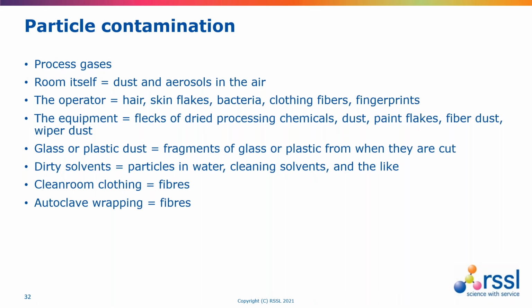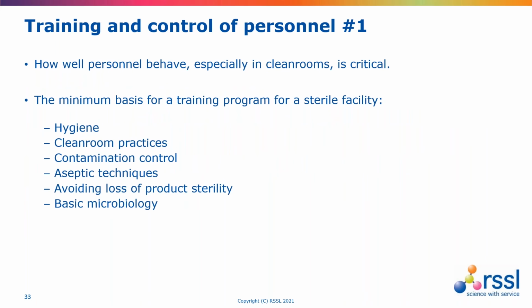And also other sources of particles, such as people. We might have flecks of dried processing chemicals. We can have poorly maintained facilities where perhaps paint is flaking off. We may have dust. We might have fragments of glass from when vials keep breaking. We may have issues from solvents as well, and from wrapping. So there's a whole host of things there we need to be mindful of.